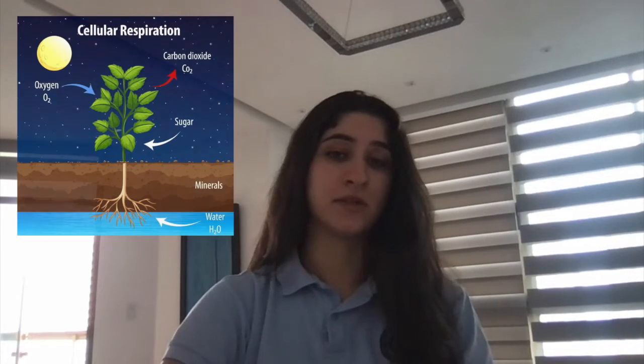In this experiment, we'll be testing cellular respiration in plants and which factors affect this process. We'll be using bean seeds, 5 boiled ones and 5 germinated ones, and we'll be seeing how these two different states can affect the process of cellular respiration.